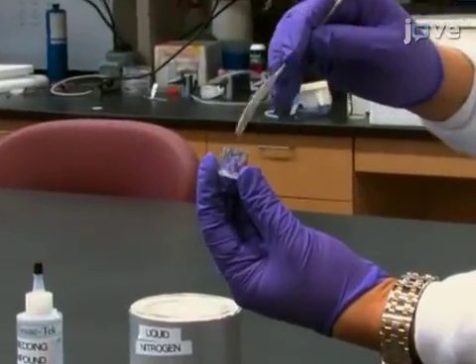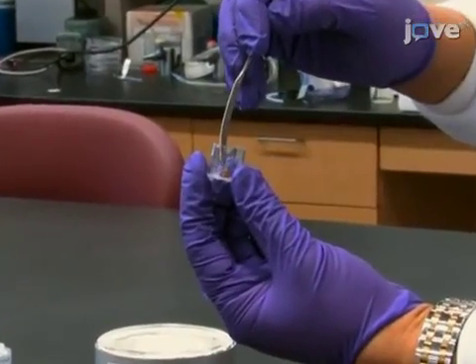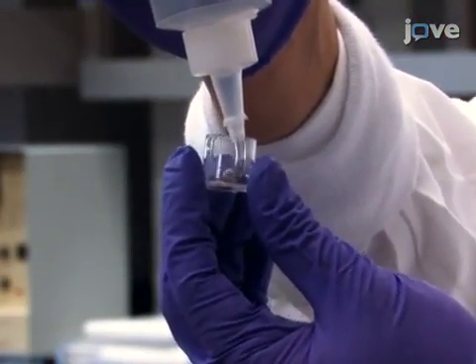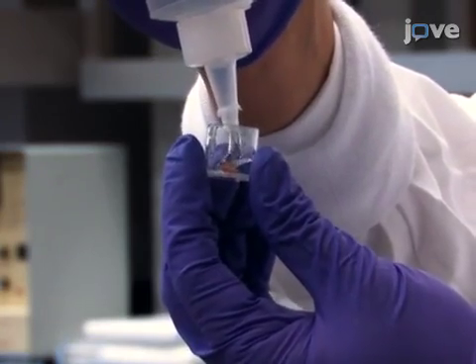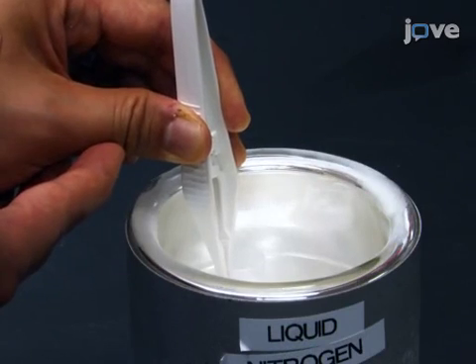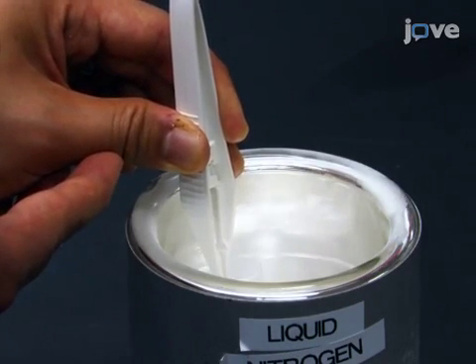Place the whole mouse organ of interest into the center of a small plastic well. Submerge the organ in tissue embedding compound up to a height of about 10 millimeters. Immediately place the tissues into liquid nitrogen for flash freezing.